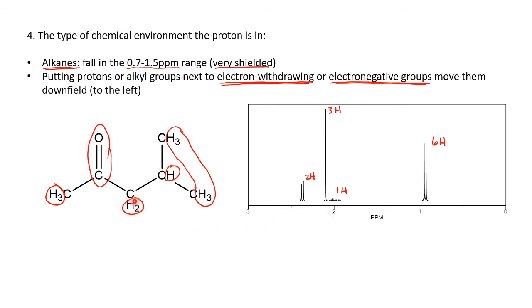These two hydrogens, which normally come out at around 1.3 ppm, are even closer to the carbonyl or electron withdrawing group than our single hydrogen is. So with these, we see a big shift from about 1.3 to about 2.3, a full chemical shift to the left. And then for these three, which are also very close to the carbonyl group, they would normally come out at about the 0.7 to 1.0 ppm range. Since they're so close to the electron withdrawing group, they're shifted over to about 2.2.